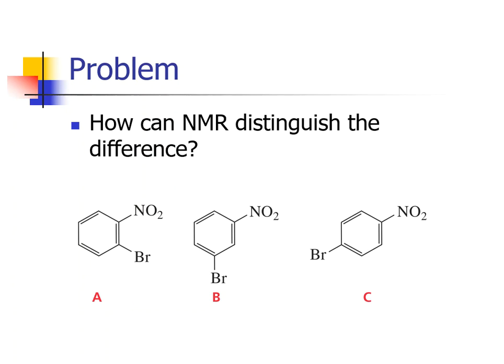Okay, so we are at another example problem time. In the last video, I told you to work on these 3 example problems, please, and try your answers and compare them to mine to see if they're going to be the same. And this question says, how can NMR distinguish the difference between the following 3 compounds?